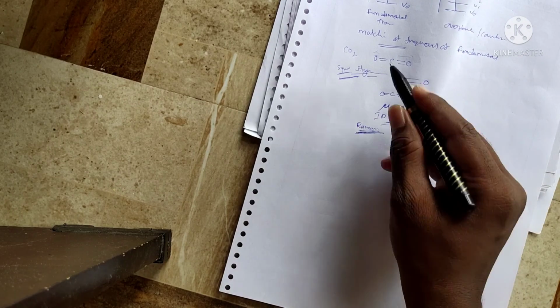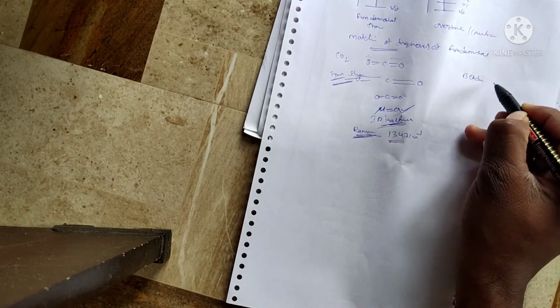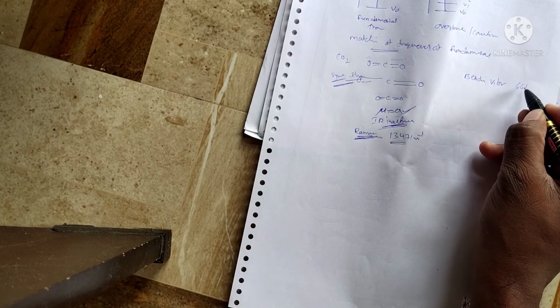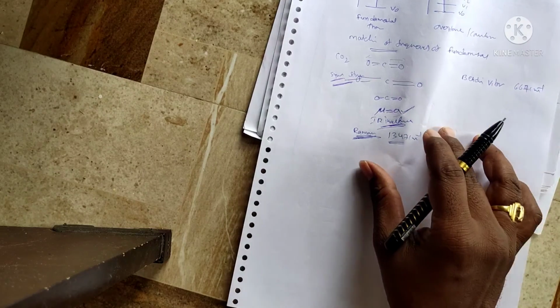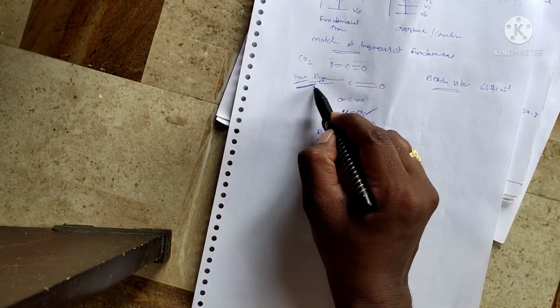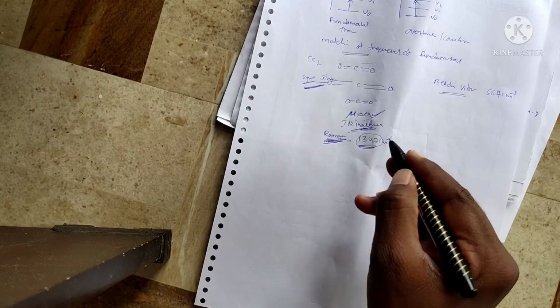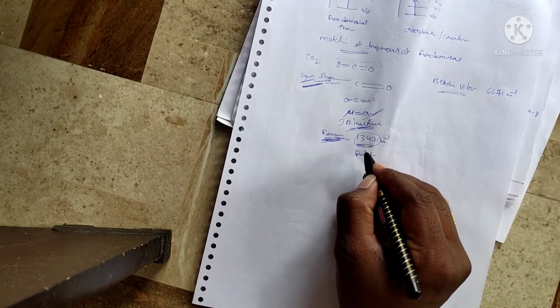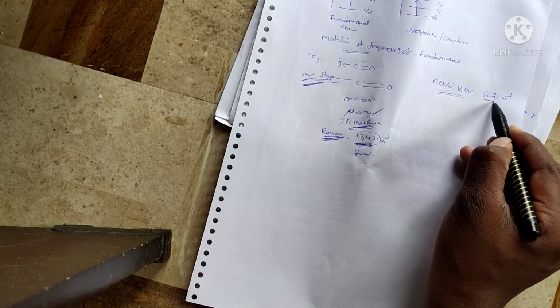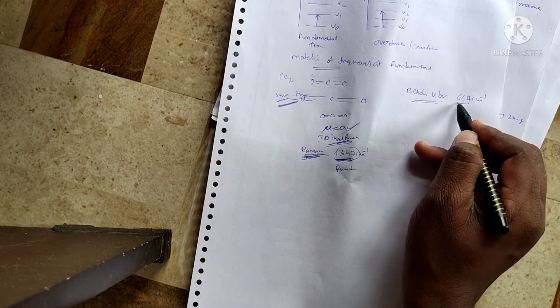That is about the stretching. Come to the bending vibrations of CO2 molecule, observed at 667 centimeter inverse. The symmetrical stretching will be IR inactive, but in the Raman spectrum it shows a fundamental band. This fundamental transition band is observed at 1347, and the bending vibration of CO2 is 667. This is the fundamental of bending vibrations.